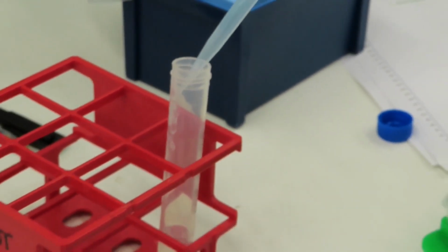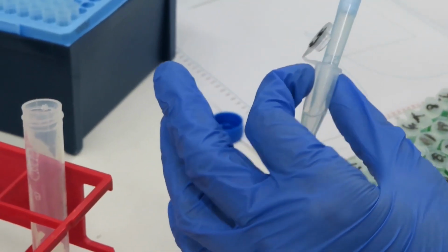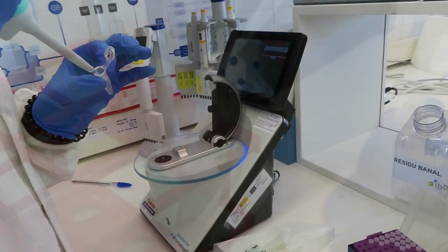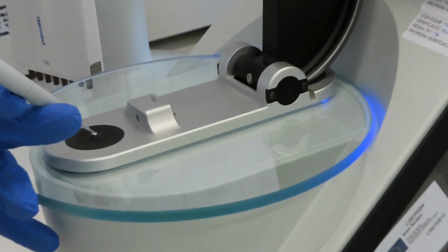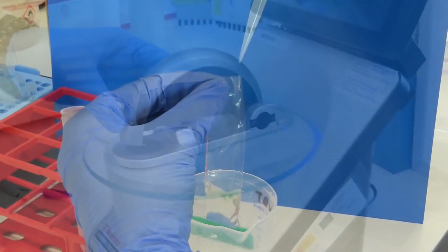All fractions from the second peak are pooled, and depending on the interest of the client, the pool can be prepared to be delivered or to carry out the next purification step. In any case, the protein concentration of the sample is determined by measuring the absorbance at 280 nanometers and taking into account the molar extinction coefficient of the protein.